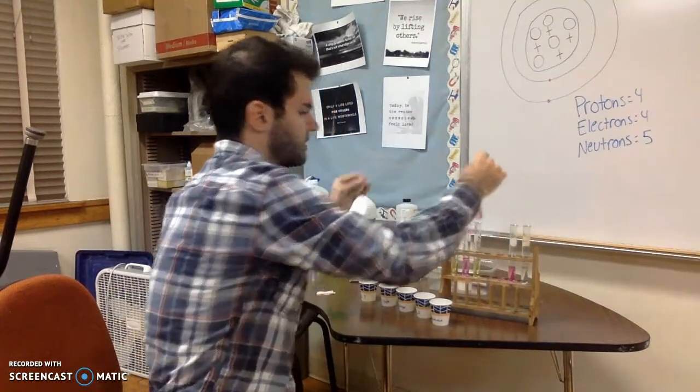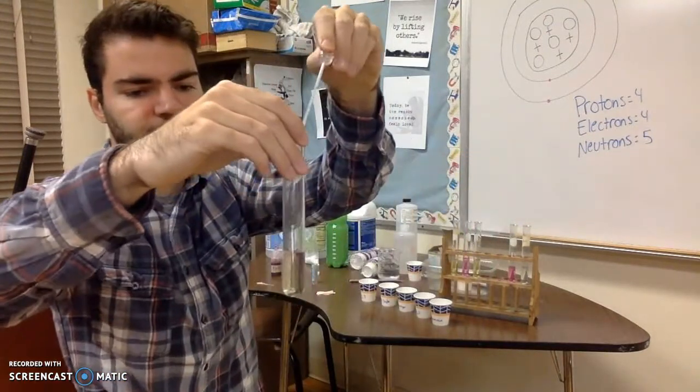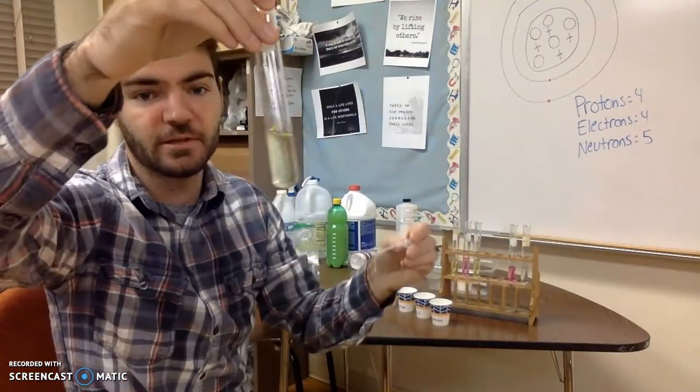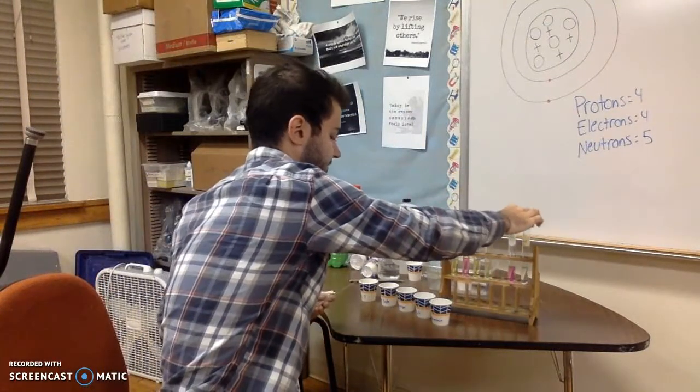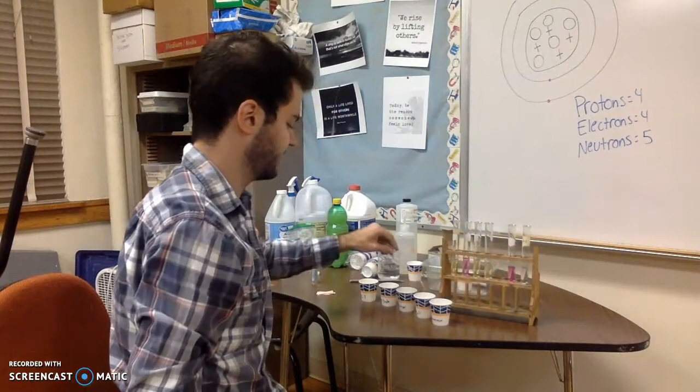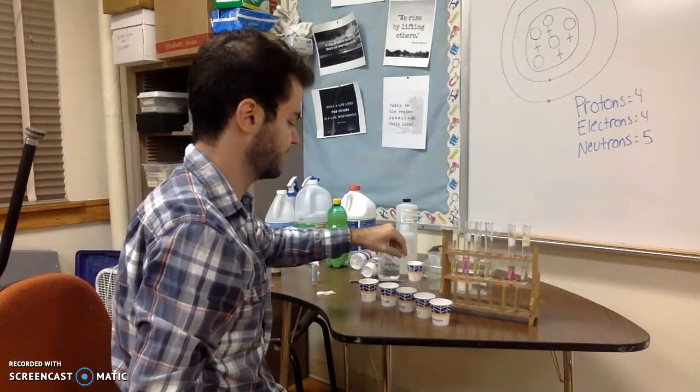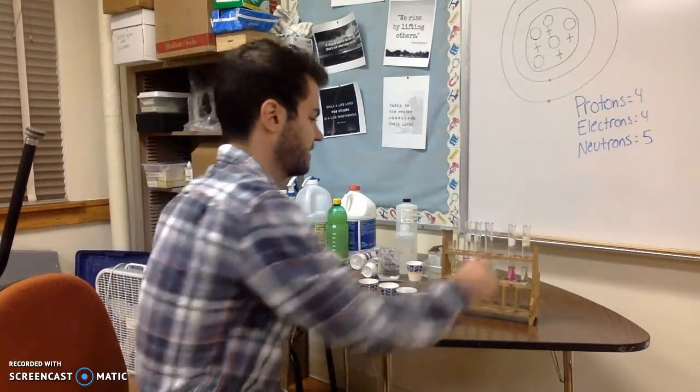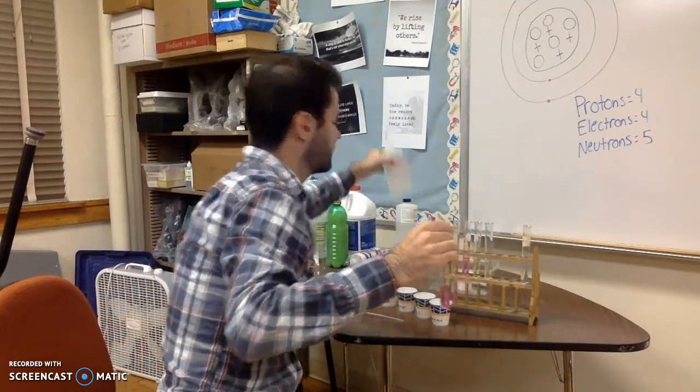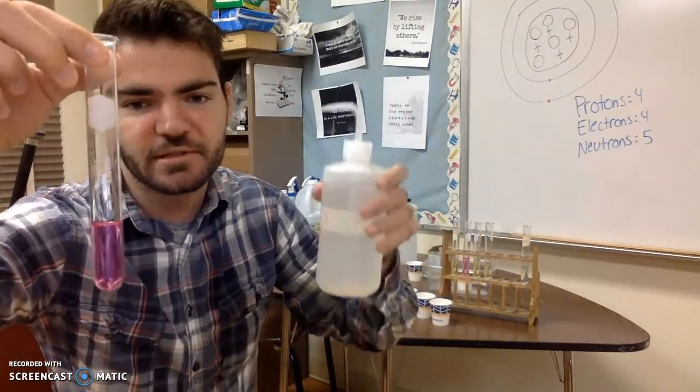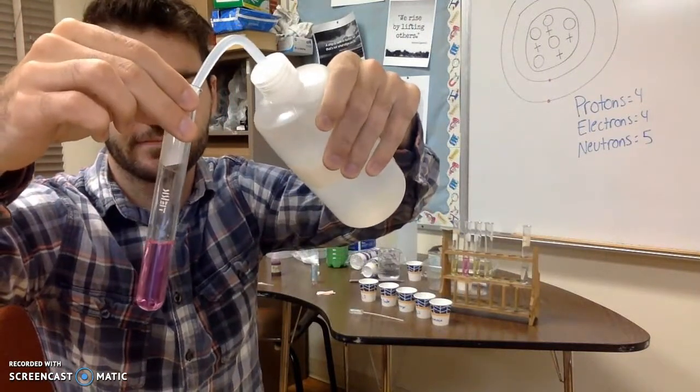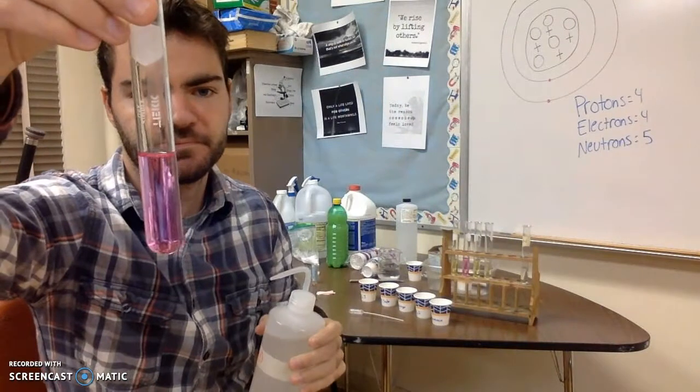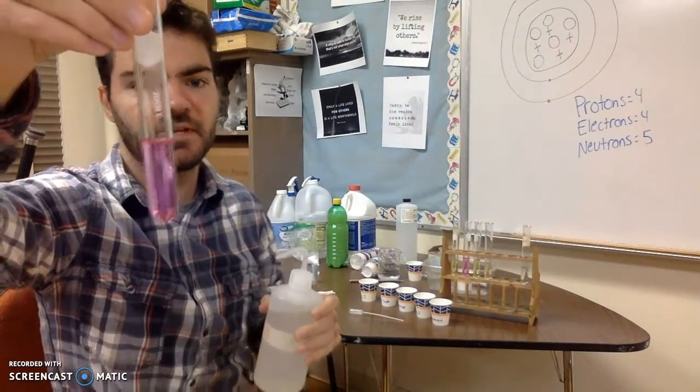Next one is just water. So I'm going to actually try this one again because there was some vinegar left in here in my pipette. So we'll do water again this time. To keep it pure, we're just going to use out of this one. So water, try it again. It can stay pink.